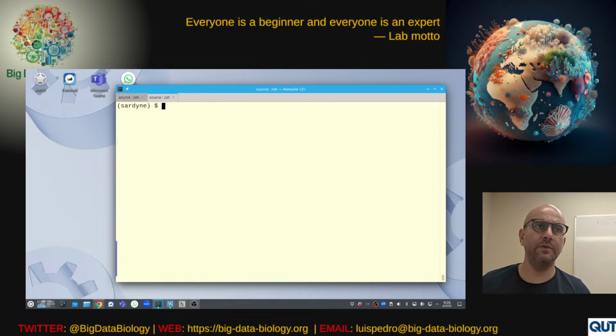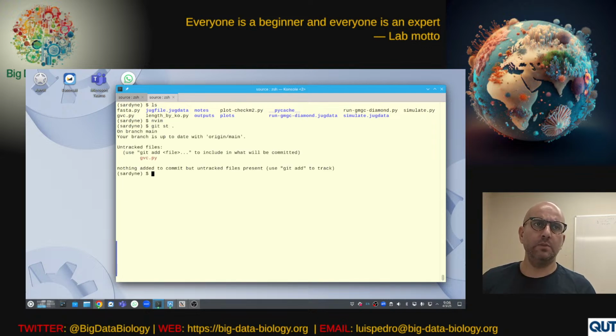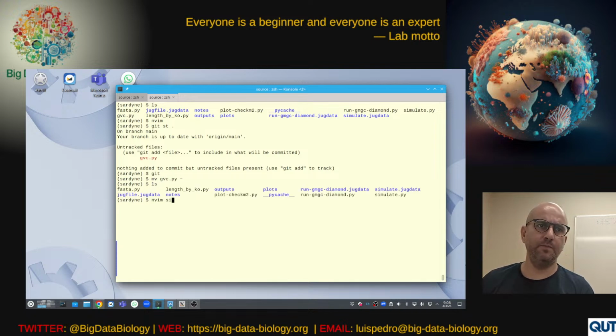Normally I like to make these have the same size. I'm just getting these to have the same font size. Yes. We've been playing around with these genomes, and let me just show you where we're at. Let me see where we're at. Okay, let's move that way.